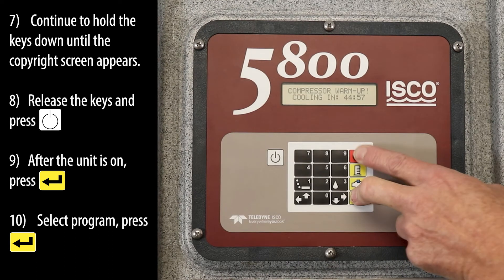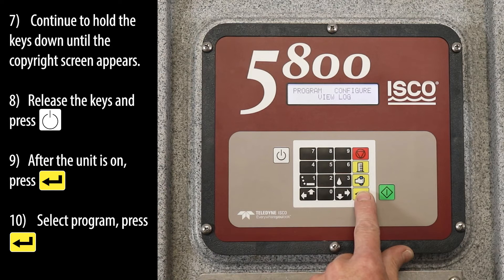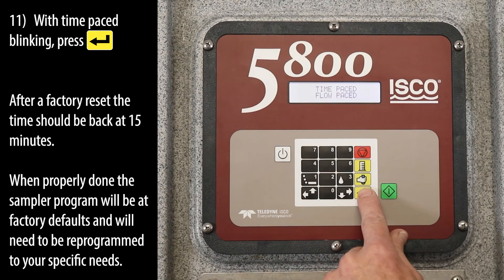Release the keys and press the on key. After the unit is on, press the enter key. Select program, press the enter key. With time paste blinking, press the enter key.